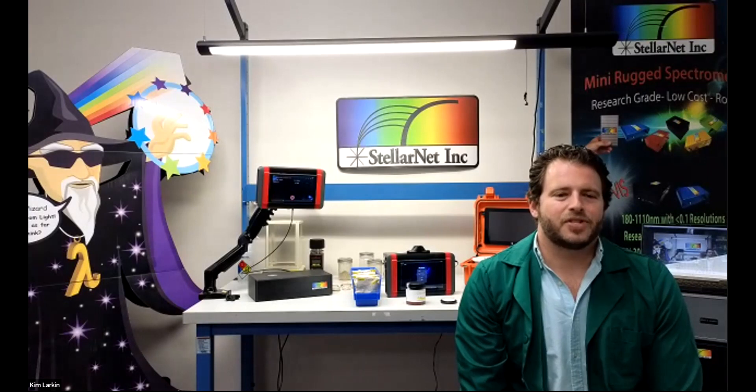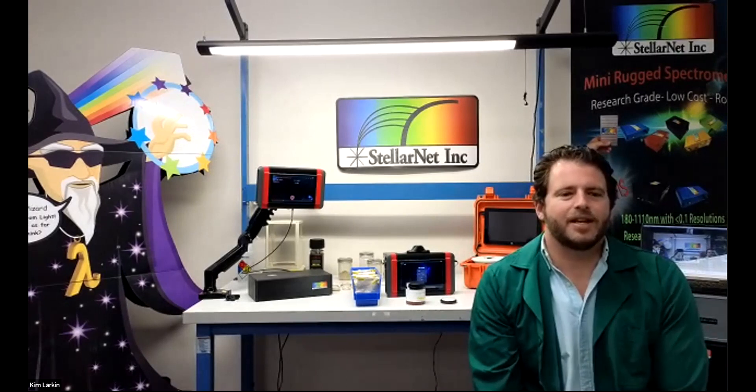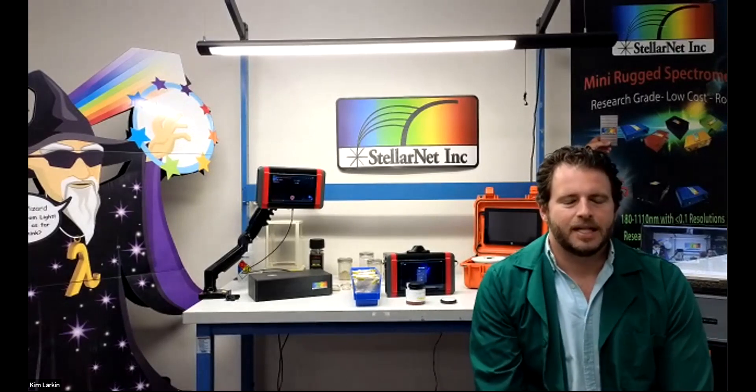Hi again. My name is Jason, and today I'll be doing a demonstration of our ChemWiz ADK near-infrared nutraceutical analyzer.